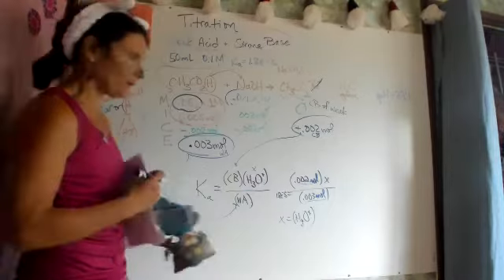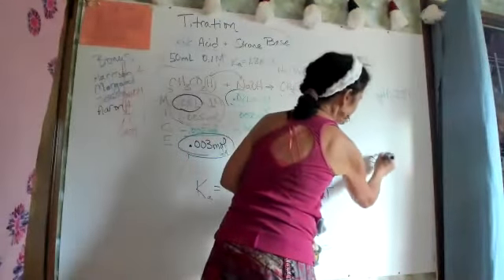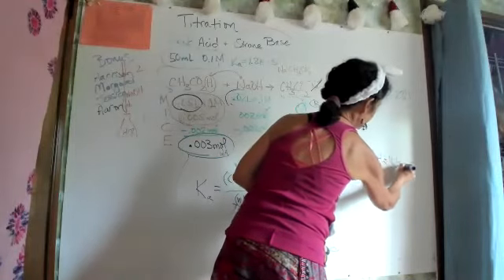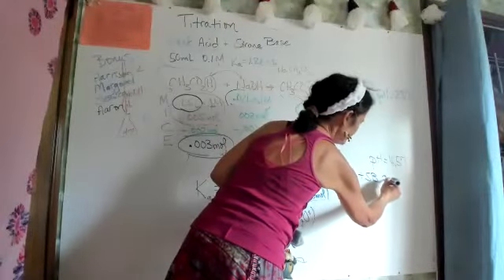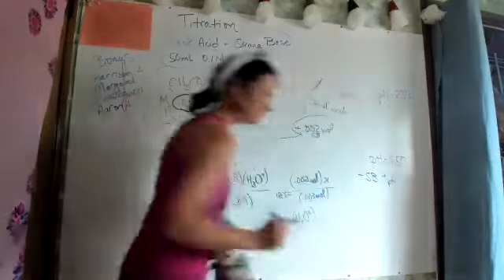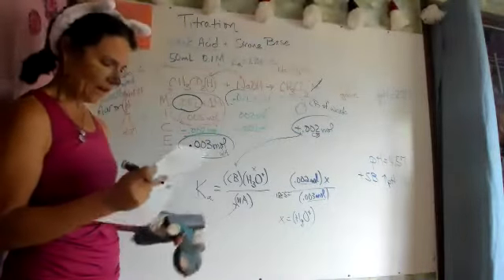All right, our pH went up. So this is step 2, our pH is 4.57. And it makes sense. We added a strong base. So we've increased the pH from where we started. All right.